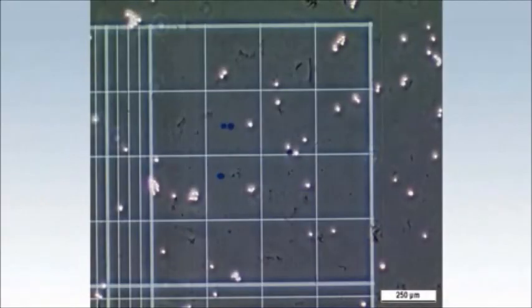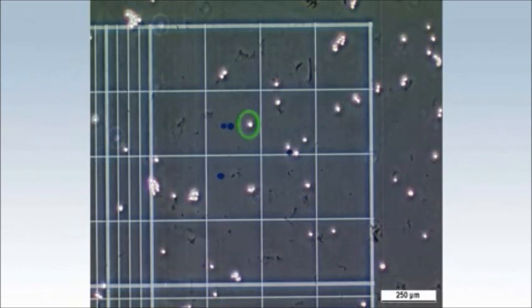The method is based on the principle that living cells exclude the blue dye trypan blue and appear clear and bright under the microscope, whereas dead cells take up the dye and appear blue.